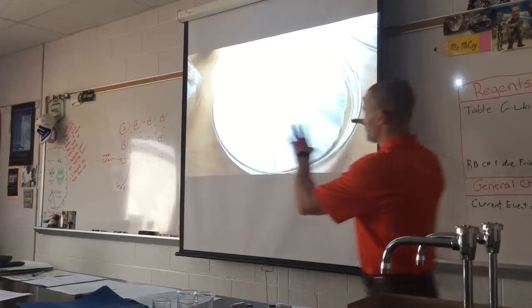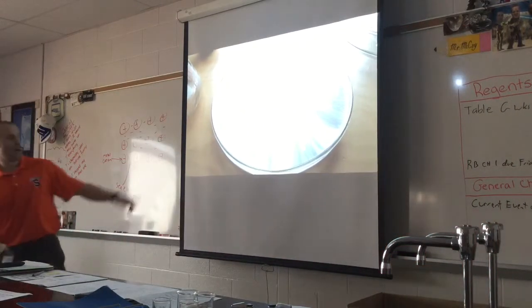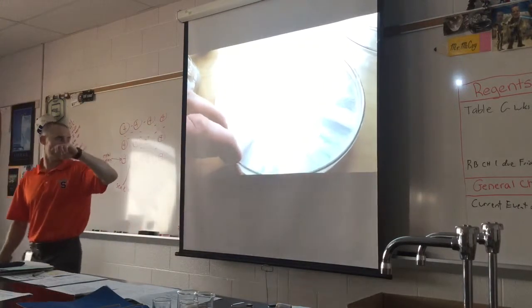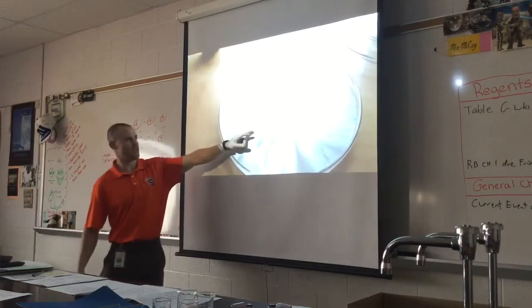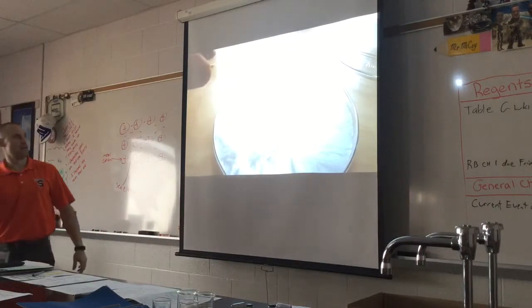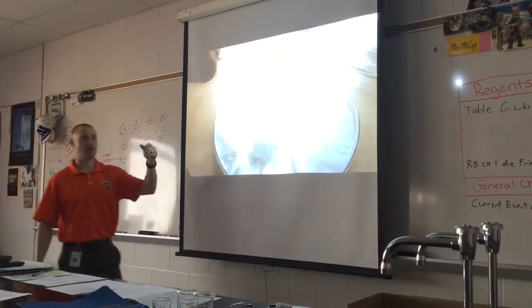That's one big crystal, basically. So now what he's going to do is pour the solution on top of this. I think it's on top of this. And what happens is it almost looks like he's pouring a solid. This is what happens when it's so supersaturated, it starts to crystallize instantly.